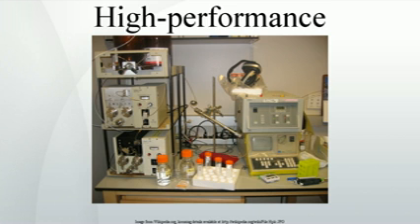Ion exchange chromatography. In ion exchange chromatography, IC, retention is based on the attraction between solute ions and charged sites bound to the stationary phase. Solute ions of the same charge as the charged sites on the column are excluded from binding, while solute ions of the opposite charge of the charged sites of the column are retained on the column. Solute ions that are retained on the column can be eluted from the column by changing the solvent conditions, for example increasing the ion effect of the solvent system by increasing the salt concentration of the solution, increasing the column temperature, changing the pH of the solvent, etc.